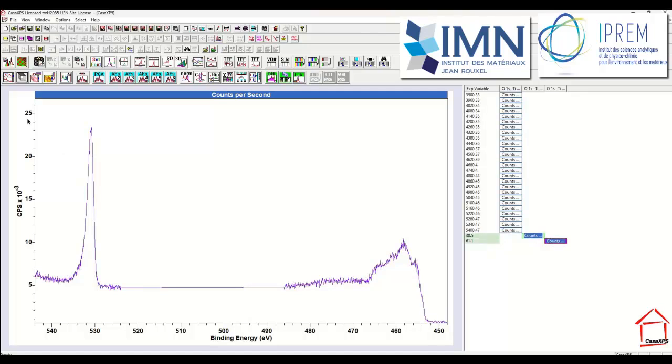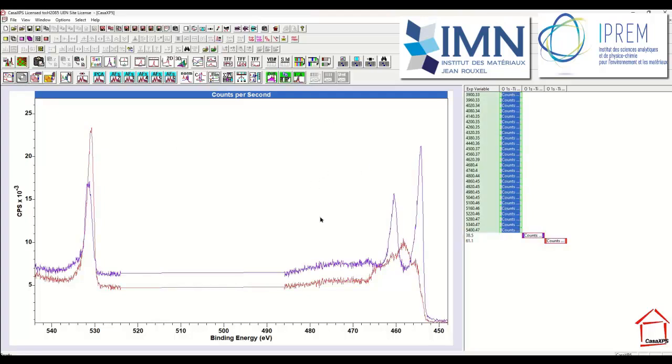So when I overlay these component spectra here, I can then compare these two spectra in different proportions that are calculated in a least square sense to the spectra that I have in this column that's selected using the linear analysis button.